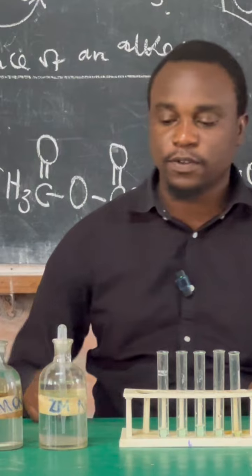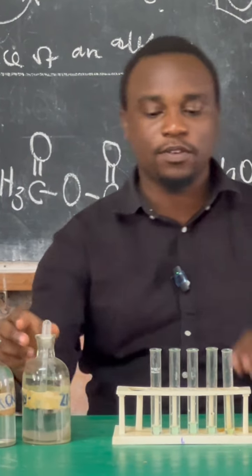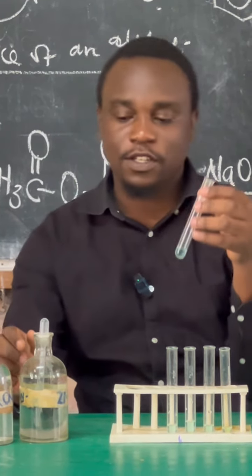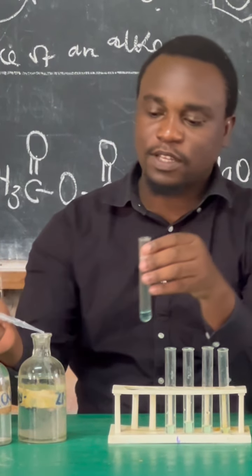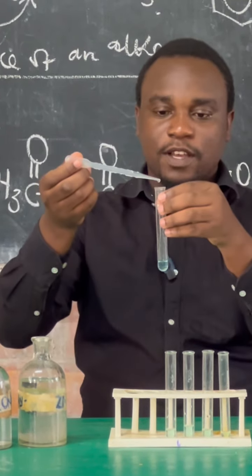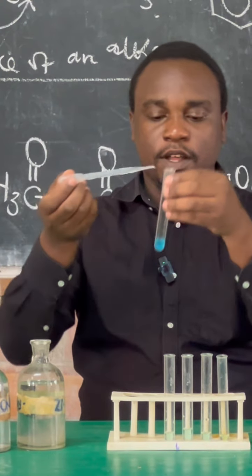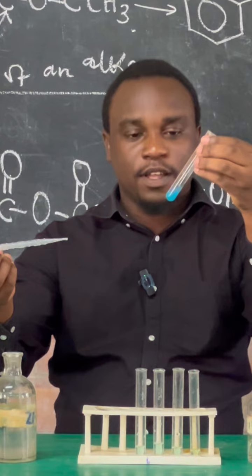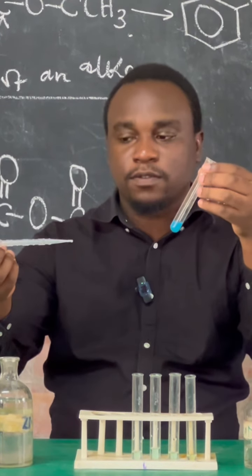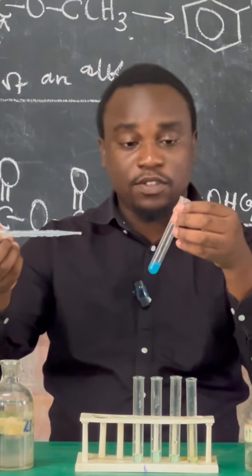First off, I will start with addition of sodium hydroxide solution to my first test solution here. Addition of sodium hydroxide to copper 2 solution, we first add a few drops. As we can see, we have formed a blue precipitate on a few additions of sodium hydroxide solution.